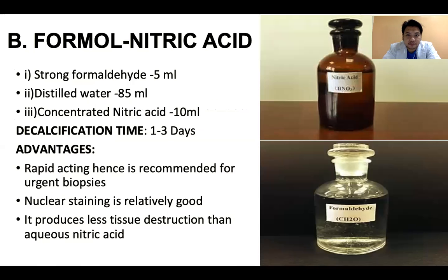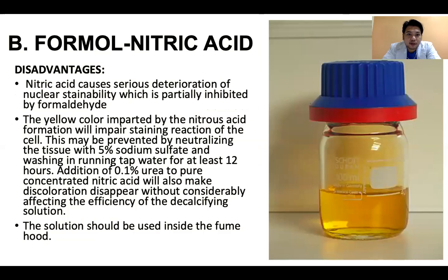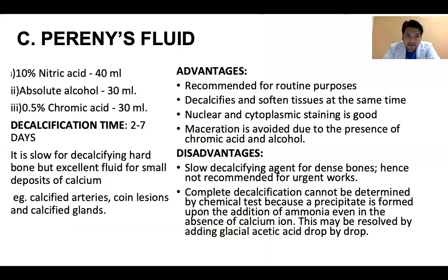Okay? Formol nitric acid, okay? Disadvantages of the formol nitric acid, class, is it is color yellow. So thus, if it is being exposed to a tissue, na-adapt ng tissue yung color ng formol nitric acid. Nagiging yellow din yung specimen.